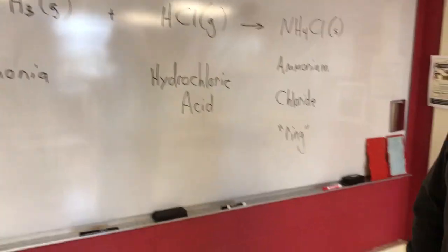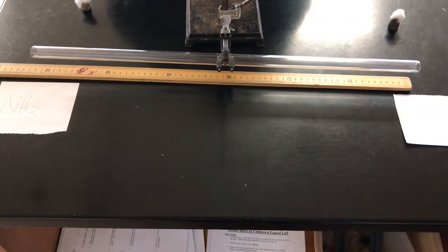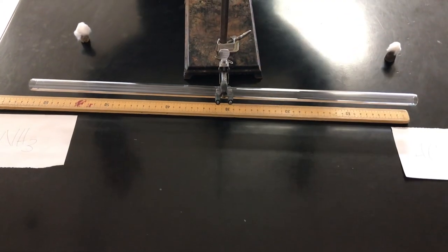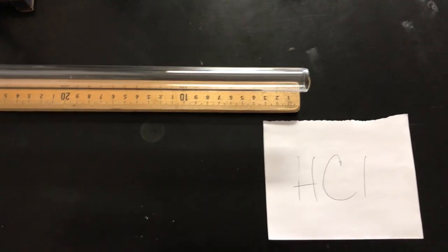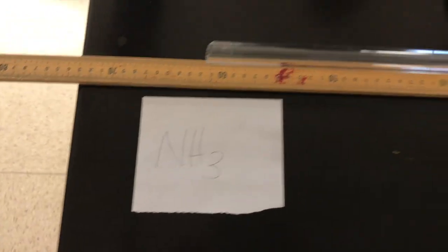And if they meet they react very easily to make ammonium chloride which is a solid. And so what will happen then is we're going to start the gases down opposite ends of this tube and wherever they meet we'll end up with a smoke ring that will mark their meeting point.